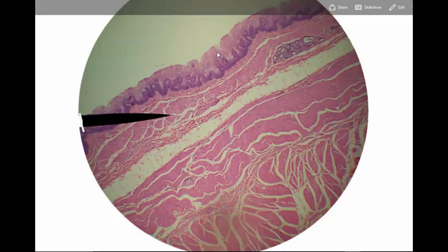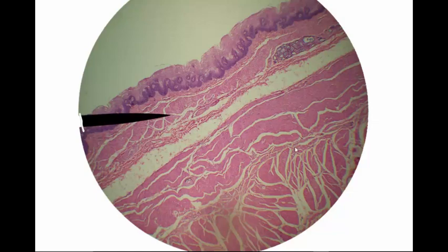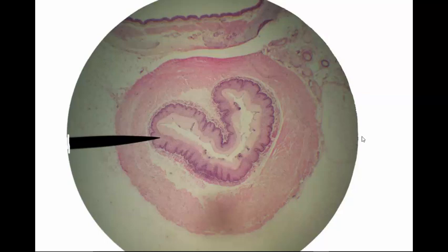How about, what is this layer up here? That is mucosa. And what layer is down here? That again is muscularis. How about this slide? Name the organ at the pointer. And the answer to that is esophagus. If you said esophagus, you got it right. Good job.